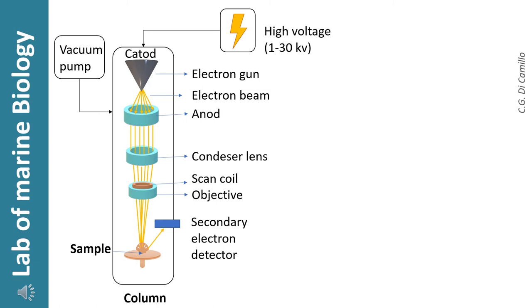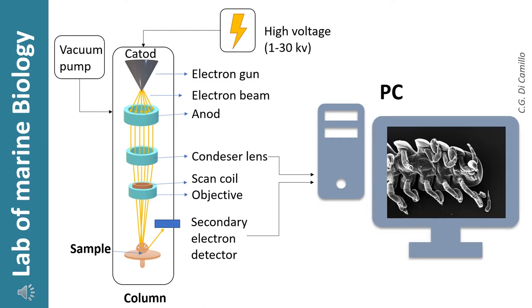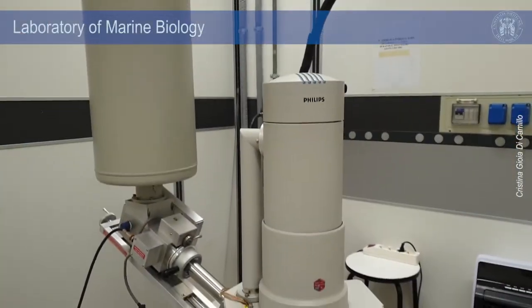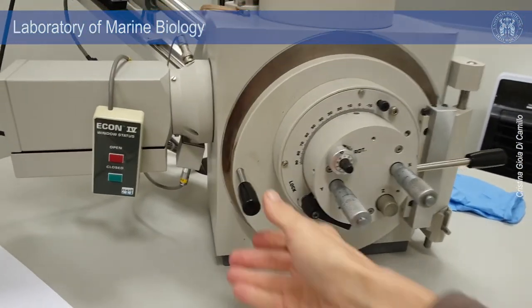The secondary electrons will be collected by a detector connected to a computer. Signals produced by the sample depend on sample topography. The elaboration of these signals allows us to obtain a highly magnified and well-defined image. In these clips you can see two different models of scanning electron microscope.